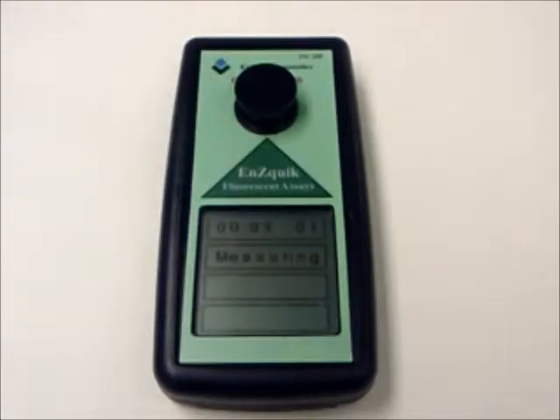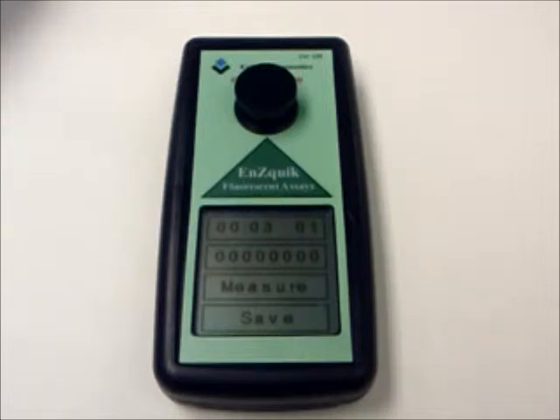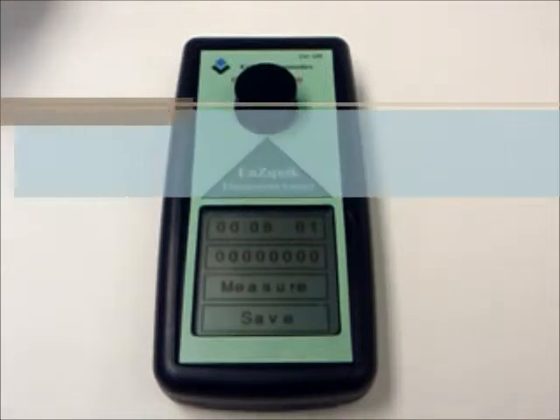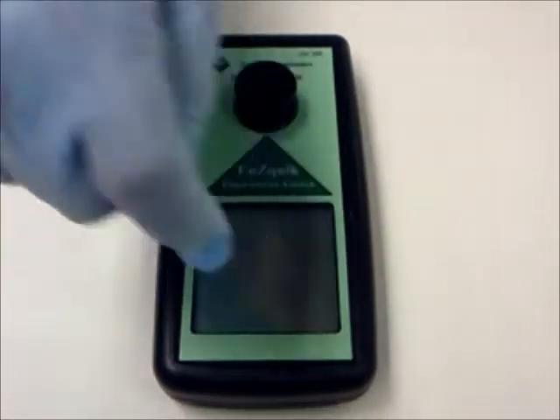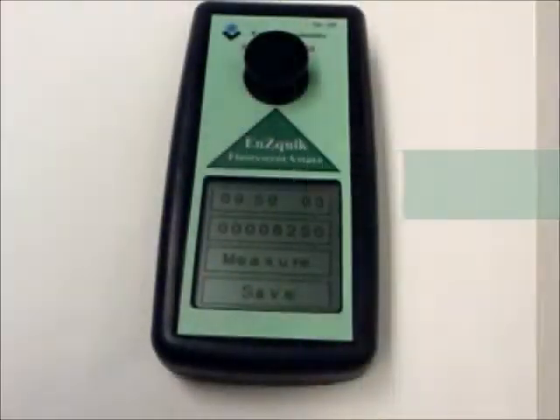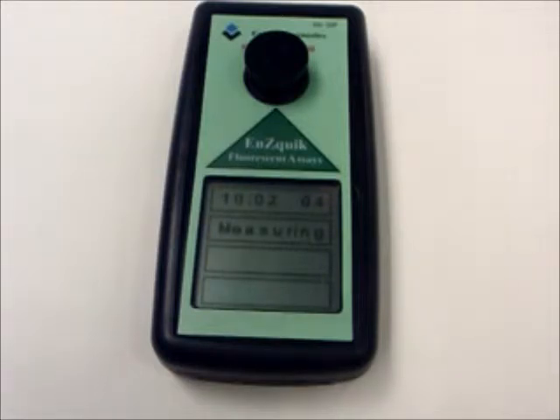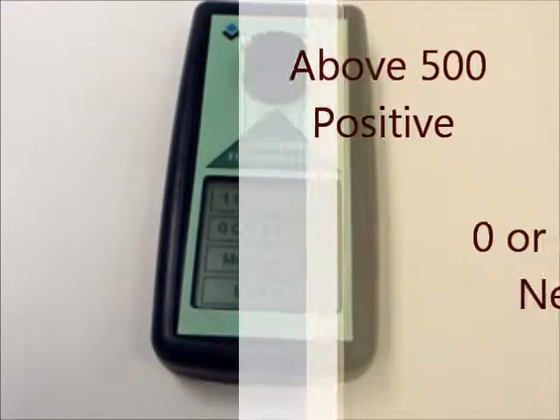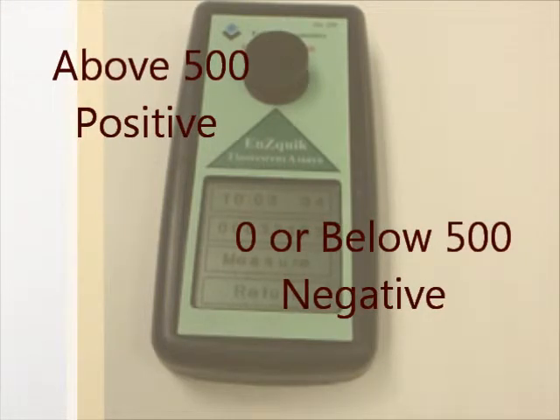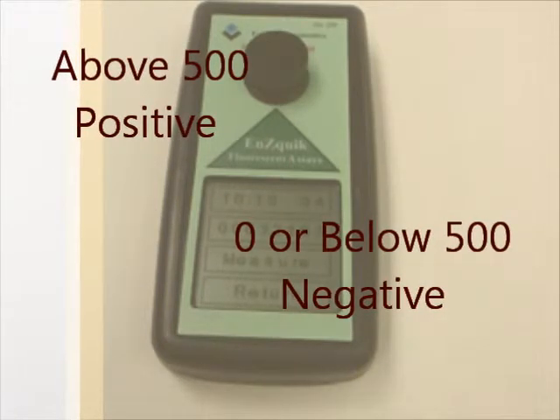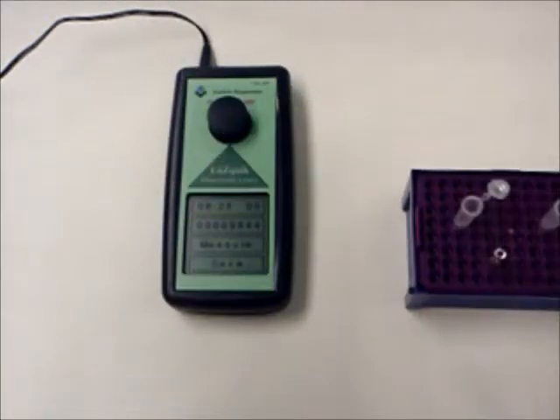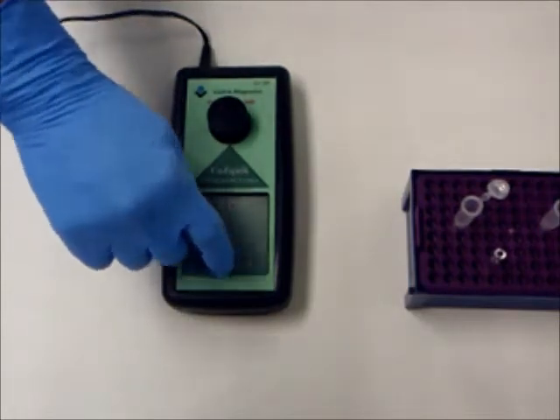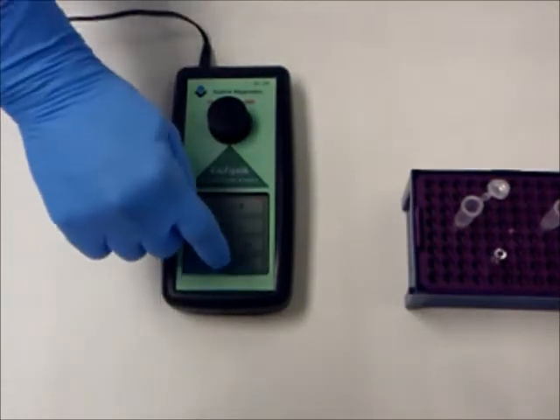Push the measure button on the touch screen for the initial reading; 01 will display on the top. Push again in 10 to 15 seconds — the reading is usually all zeros. Wait 10 minutes. After 10 minutes, the fluorometer will automatically take a reading and a value will be displayed in the box below the timer. Any numerical value above 500 is a positive result. A zero reading as well as a reading below 500 is negative. Return to the main screen by pushing save once and return twice before running a new sample.